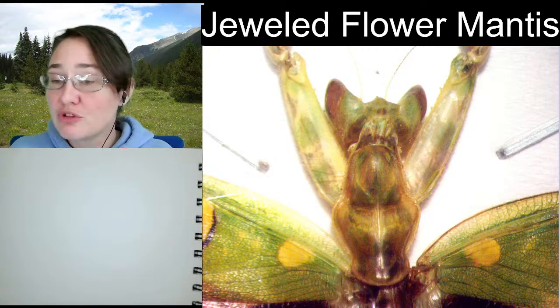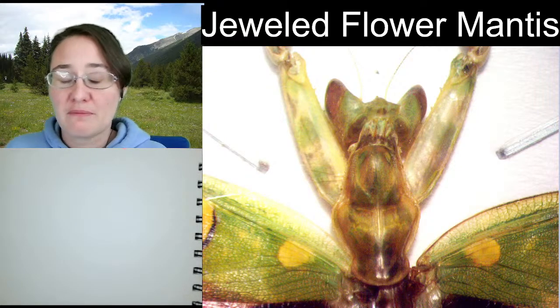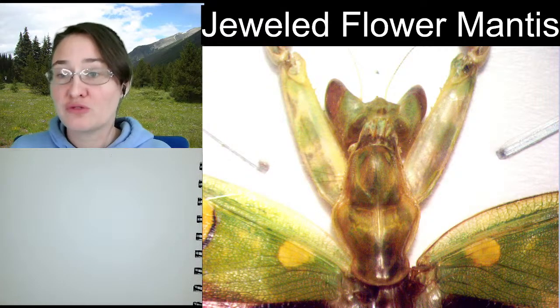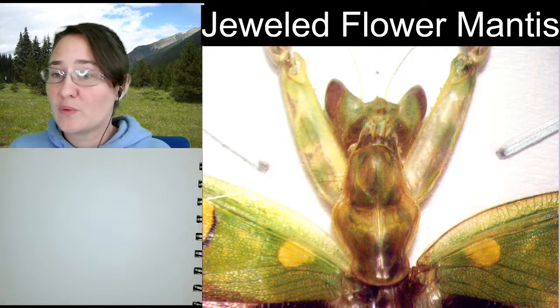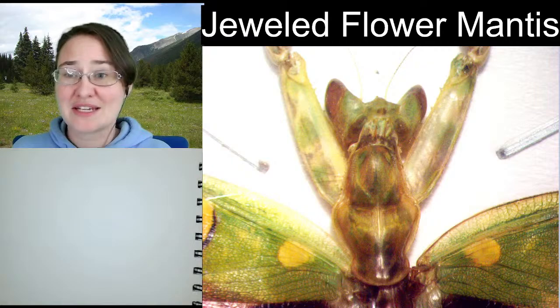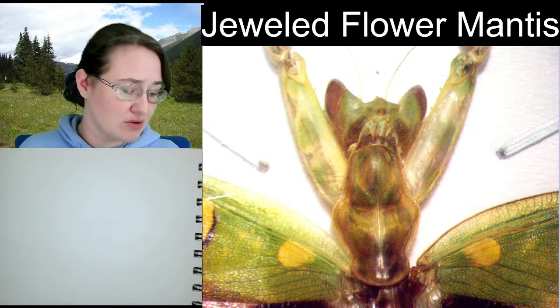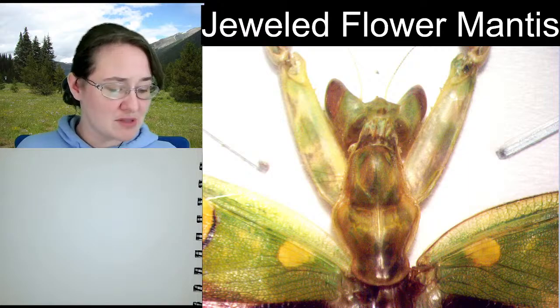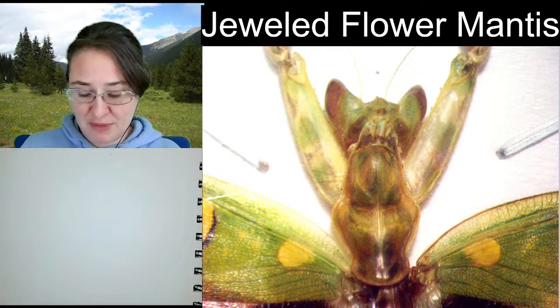We have a jeweled flower mantis under the microscope right now. The microscope is as zoomed out as it will possibly go, so where this mantis isn't a huge mantis in the world of mantids, it is still too big to show in its entirety underneath my microscope. This is one of those specimens that I have not yet put a pin through. I have not yet pinned.